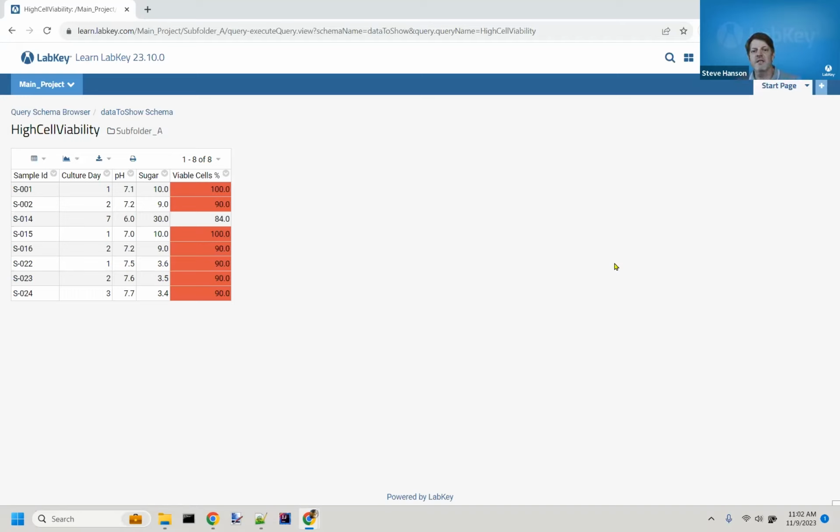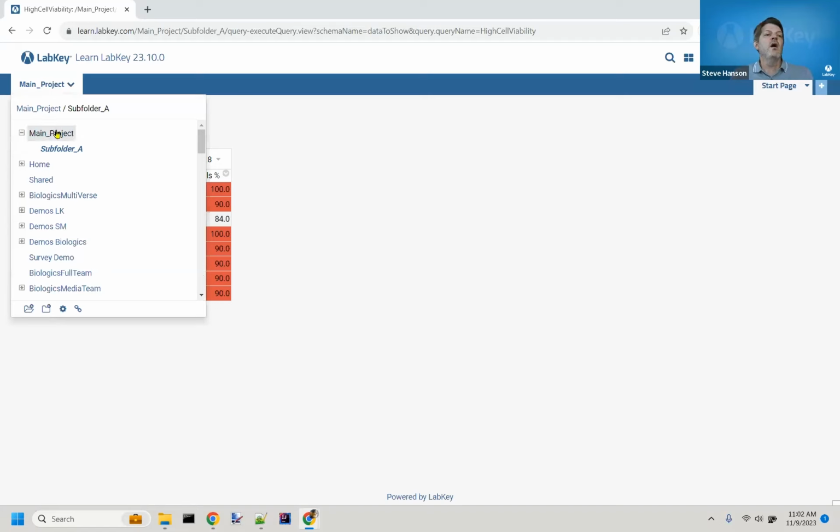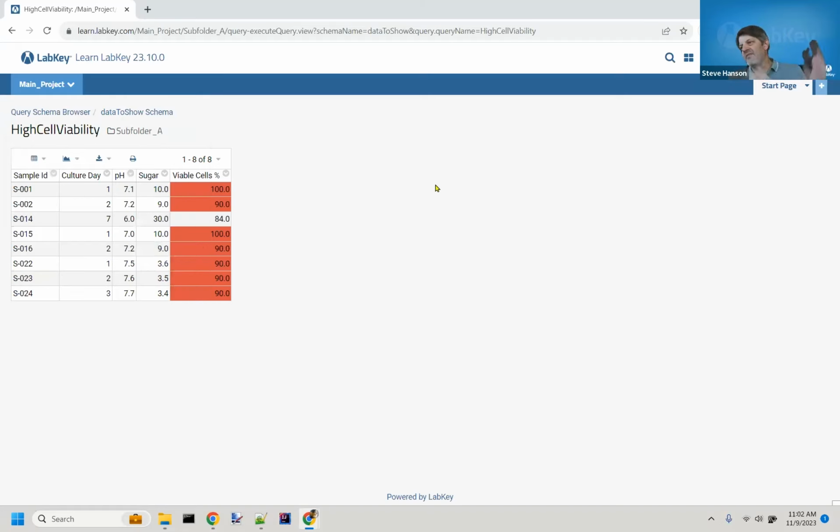This is, again, just a technique administrators should really learn, because you can just do so much with it. So again, the technique is make some views of the data that you want to show, create a linked schema somewhere else, and show those queries. That's it. That's all I just did. Oh, and then do independent security on that folder. Right now, we haven't really done the security part, but imagine that I'm only going to let a few people in to see this query now. I'm going to hide the source project and everything.